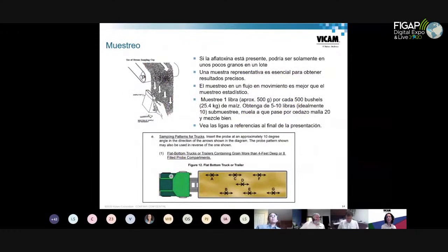Okay, so for sampling, the importance of sampling is to get a sample that's representative of the lot.